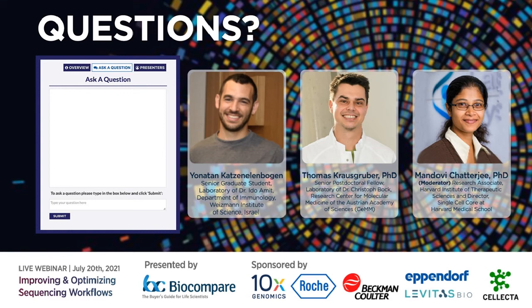I'll give you an example from the last few months. We're struggling now with preparing blood samples in our lab, a tissue that seems to be very easy, just a very everyday thing people do in their labs. We're struggling with this because it appears that they tend to be very delicate in some conditions, and we're having a hard time extracting valuable data out of them. So you need to be very precise with how you're preparing your sample.